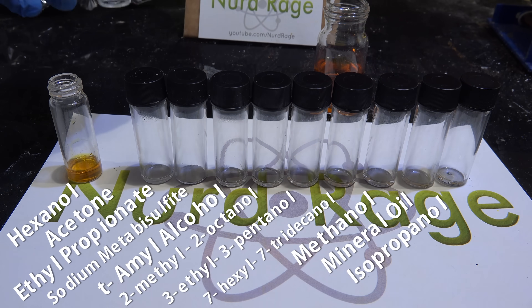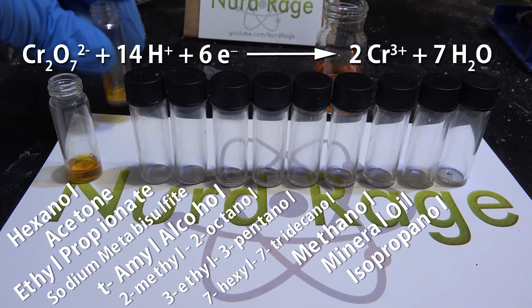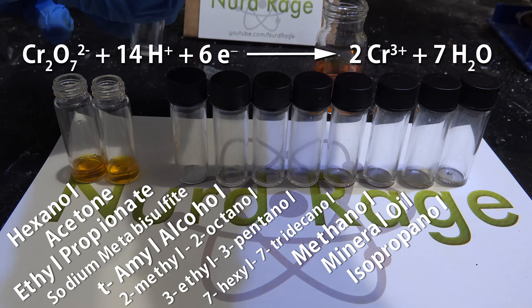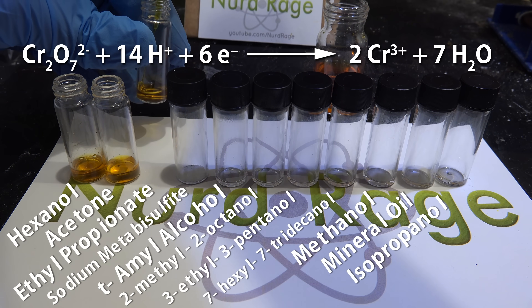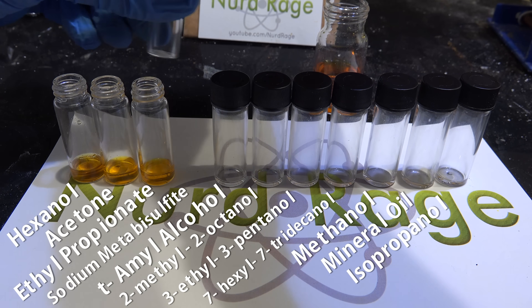Dichromate is a strong oxidizer, especially when acidic, as high acidity raises the redox potential. When it reacts with a reducing agent, the normally hexavalent chromium atoms become trivalent chromium atoms. In water, trivalent chromium is green in color, so the color change from orange to green gives us an indication that a redox reaction is happening.